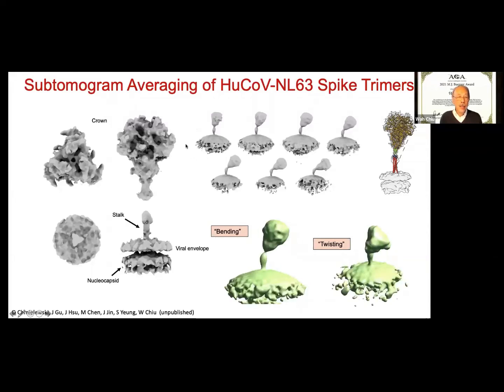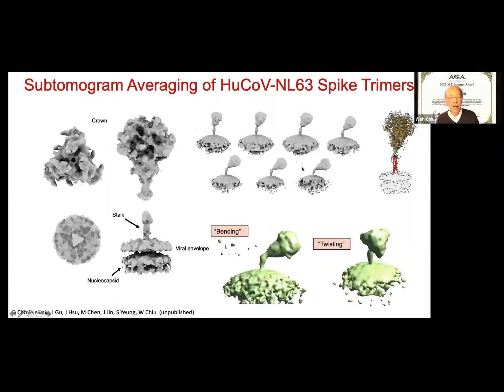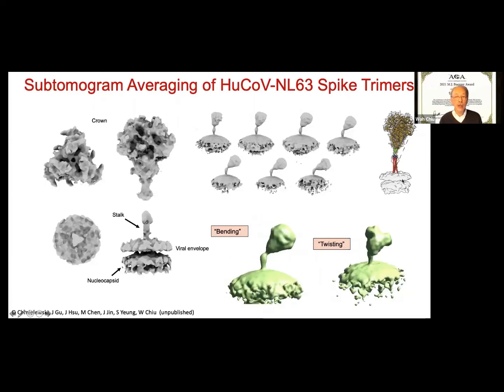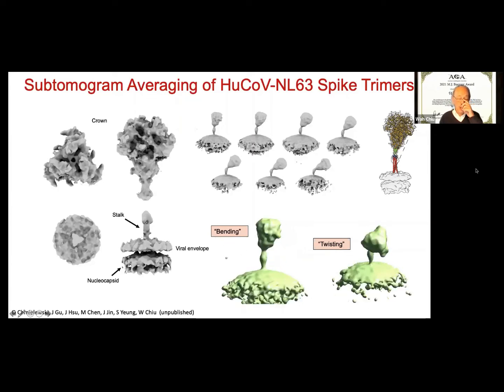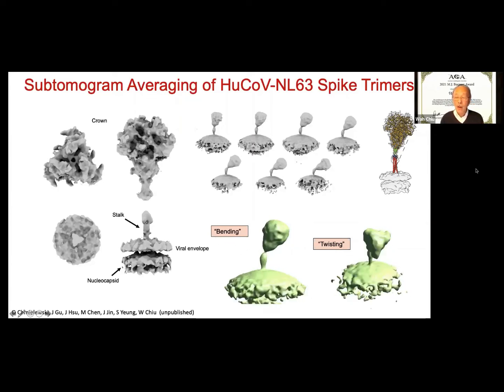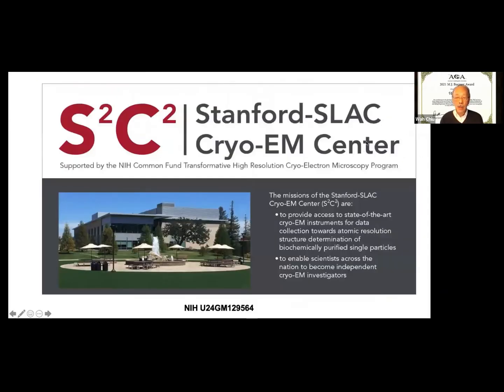So these are the 3 examples I demonstrated of how we can use single particle. The last example is a hybrid of single particle and tomography of individual protein or RNA structures at near atomic resolution. About 3 years ago, I was fortunate enough to be awarded a grant from NIGMS with support from the Common Fund. We are one of the 3 centers supported by this new initiative, called the Stanford SLAC cryo-EM Center, which has 2 missions.